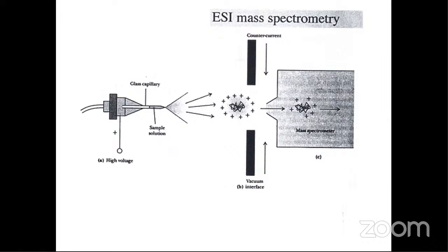Whereas for small molecules or phytochemicals, we can go for the simple electron bombardment technique. But for proteins, it's good to go for ESI or MALDI type of techniques, which are much milder, so that you don't get too many fragments, and then the mass spectrum doesn't become very complicated and very difficult for you to identify the various amino acid sequences.